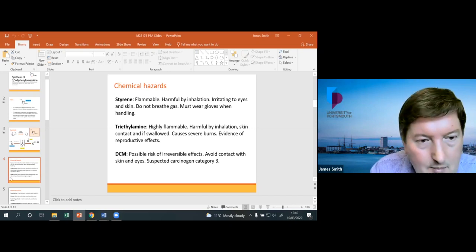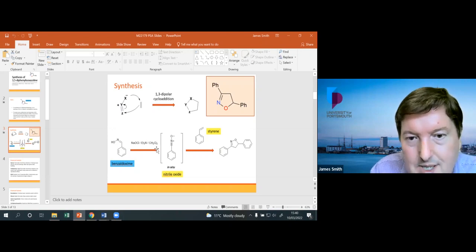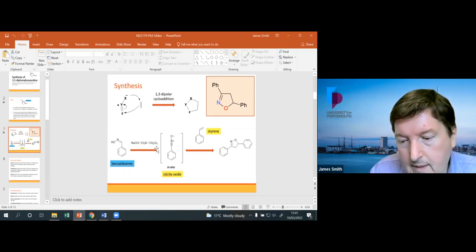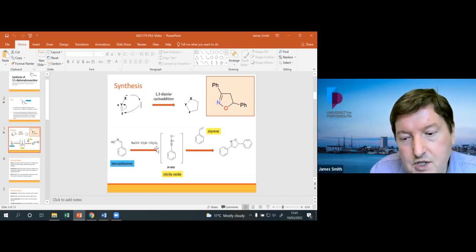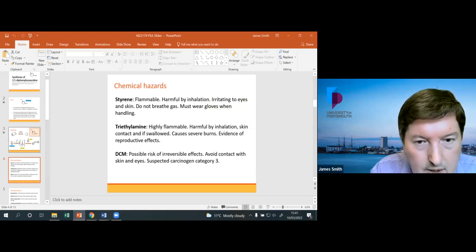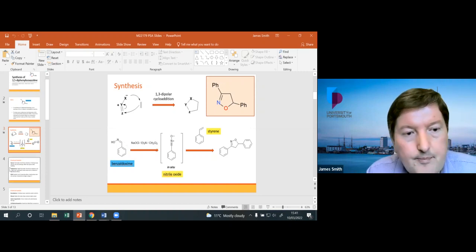Dichloromethane, DCM. What's dichloromethane? This one here, CH2Cl2. Yeah, so think about methane, CH4, yeah, tetrahedral structure. Swap out 2 of those hydrogens for 2 chlorines. Then you get CH2Cl2. And it's a solvent. Yeah, it's a solvent. Dichloromethane solvent.